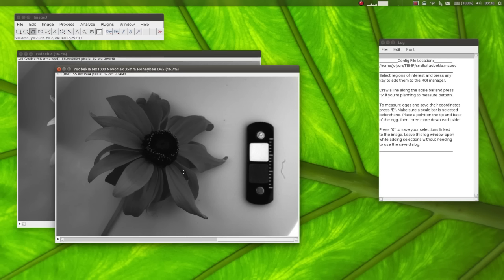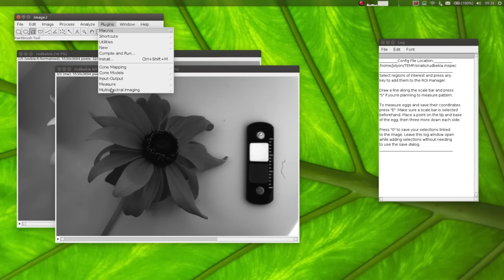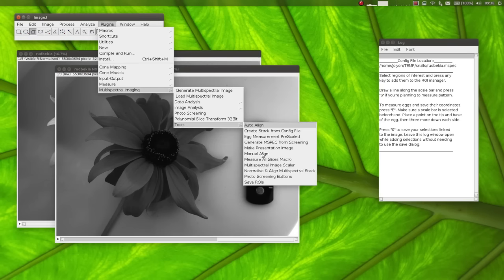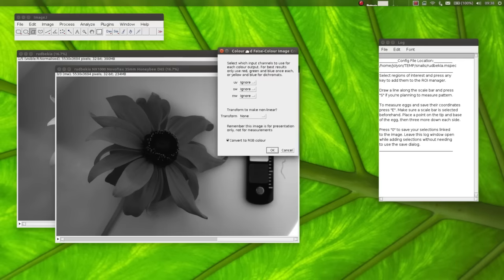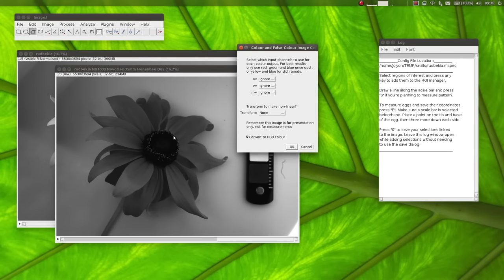This image, of course, doesn't look very useful. It's useful for measuring, but it's nice to be able to see what it might look like to a honeybee sometimes. And there's a tool added to the toolbox that just lets you do that. If I go into Tools here and make Presentation Image, this allows us to create a false color image from the channels of honeybee vision here. So I want to roughly make this as close to human vision as possible, so I will turn the medium wave into red, the short wave into green, and the UV into blue. So these are like human channels shifted down one wavelength band.